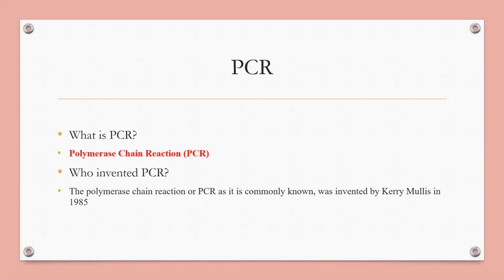PCR is a laboratory technique, meaning an in vitro technique, for generating large quantities of specified DNA. PCR is a cell-free amplification technique for synthesizing multiple identical copies of any DNA of interest.